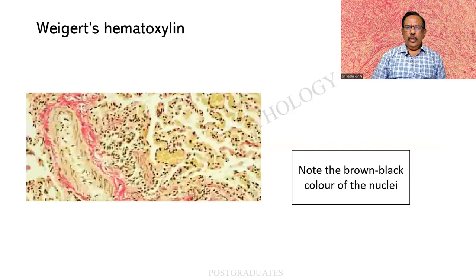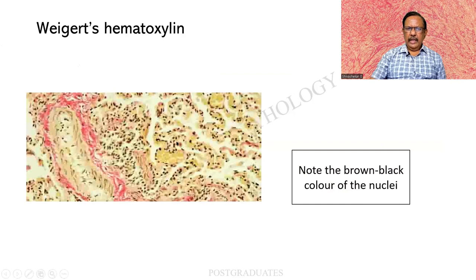Look at this one — this is the Weigert's Haematoxylin. Haematoxylin is always a nuclear stain; it can be black, brown, or brownish black. This is the Weigert's Haematoxylin. The first step in any of the special stains will be to do the nuclear stain. So this is Weigert's, and I am concerned only about the nuclei — they have been well taken up. I will be proceeding with the stain.